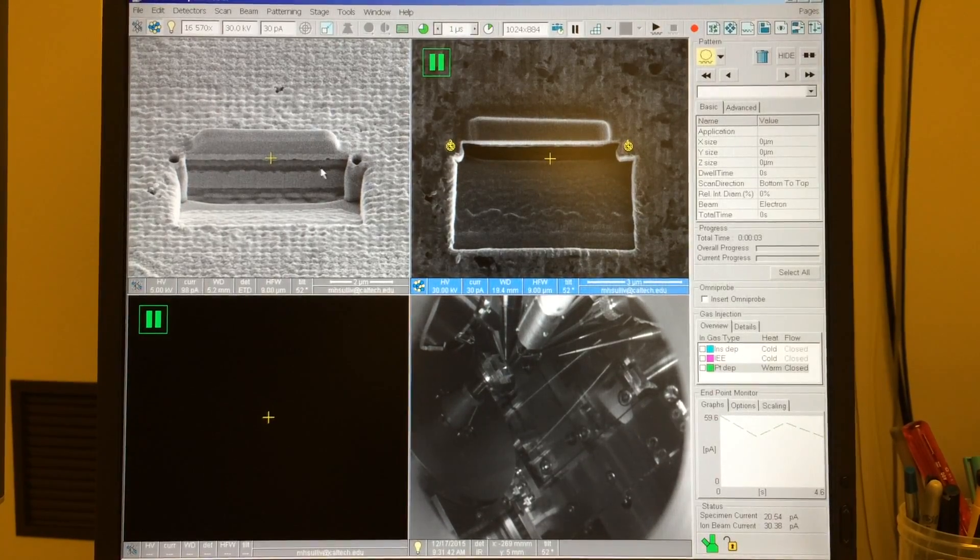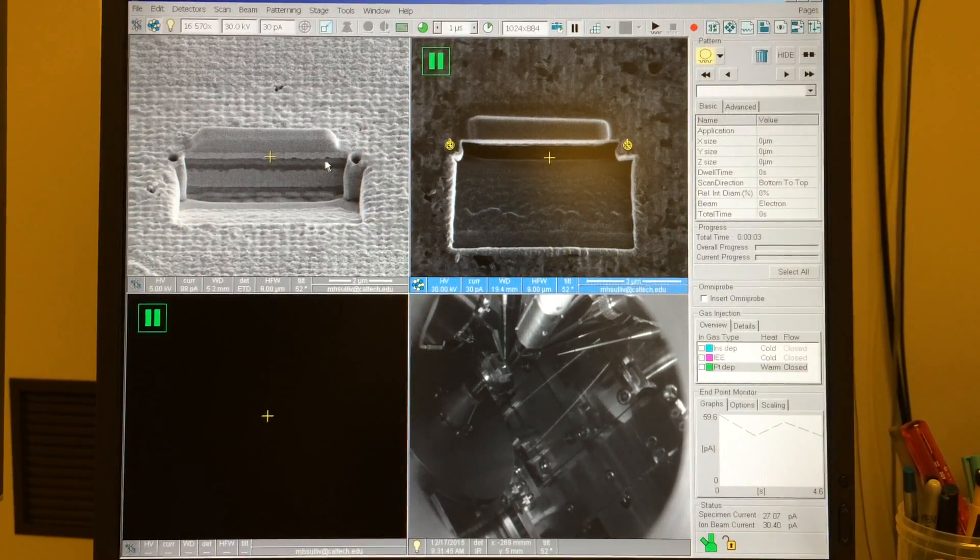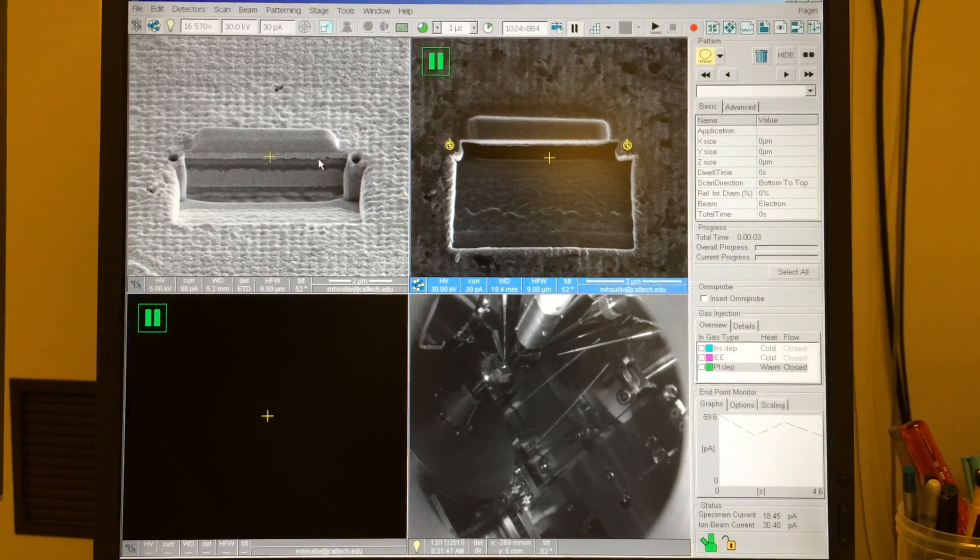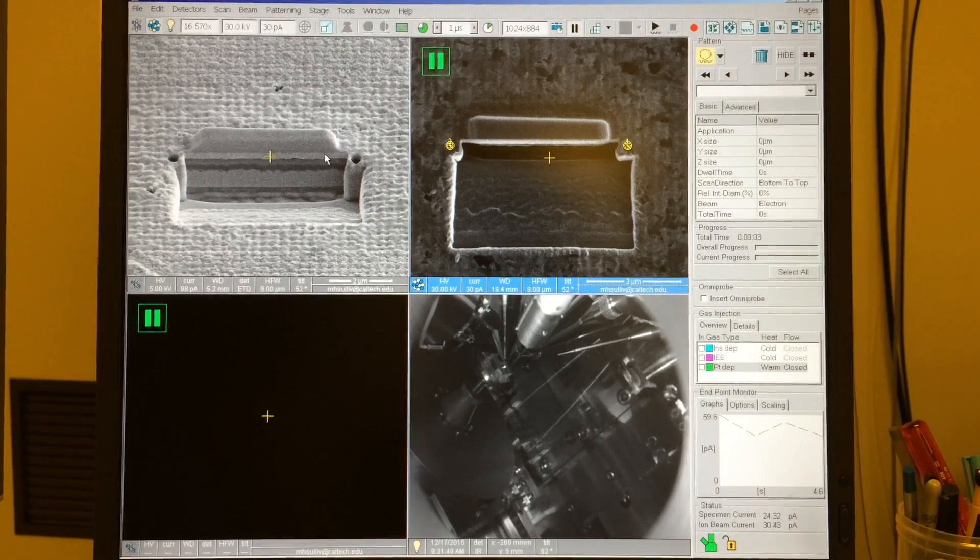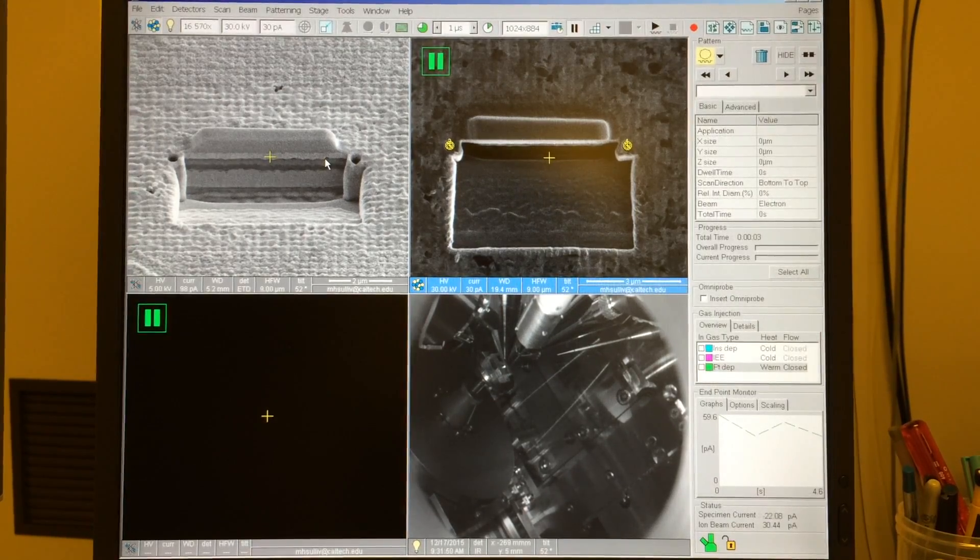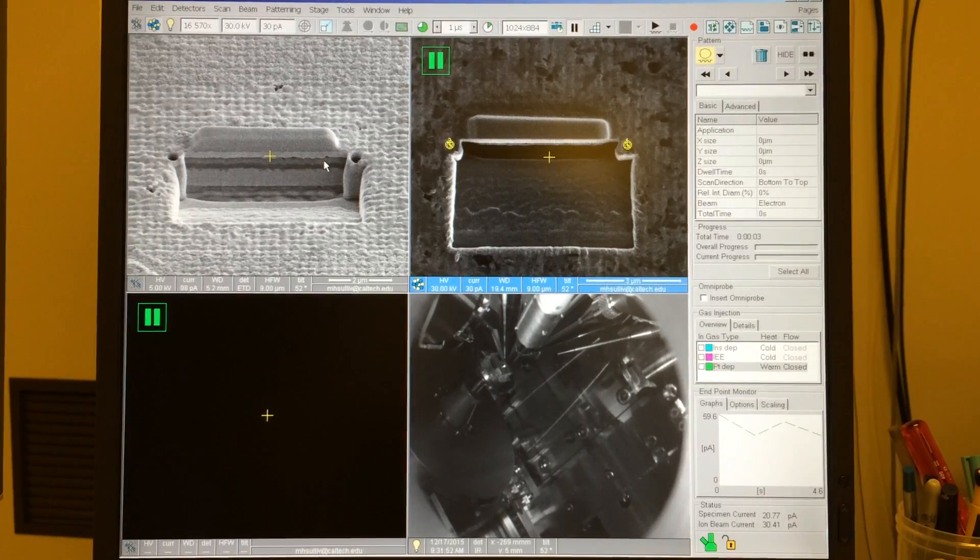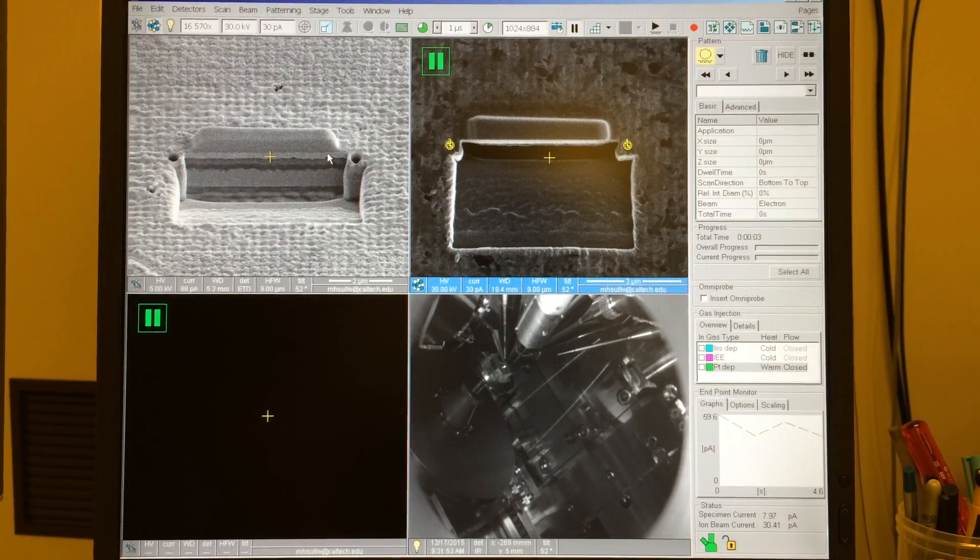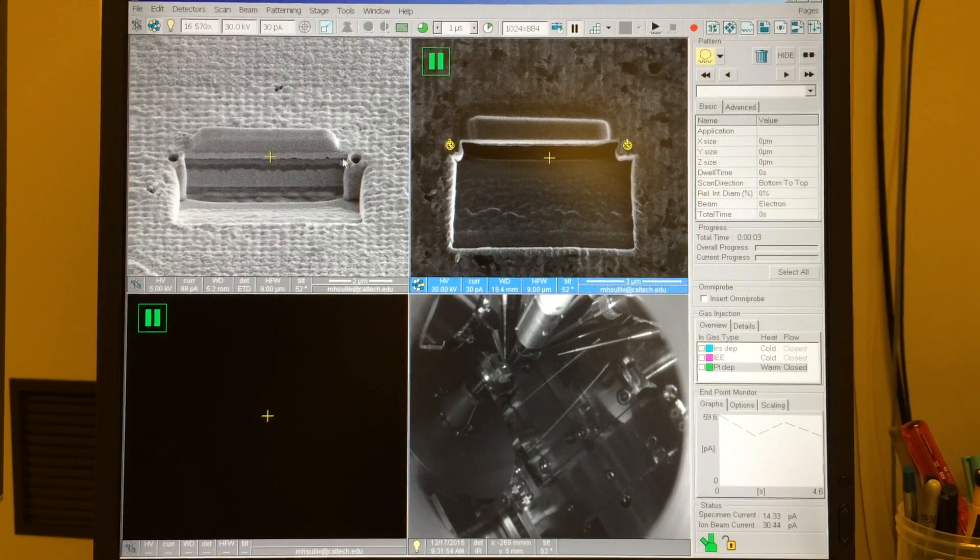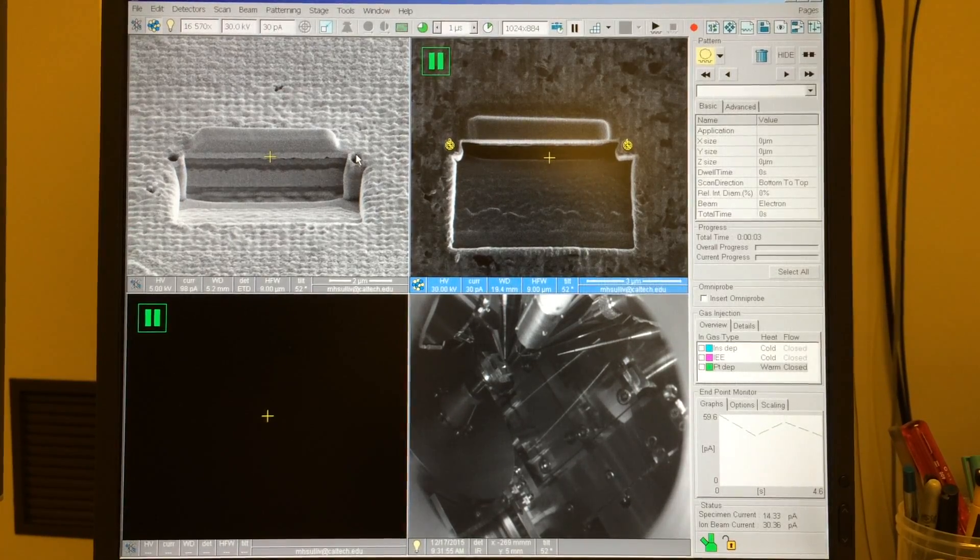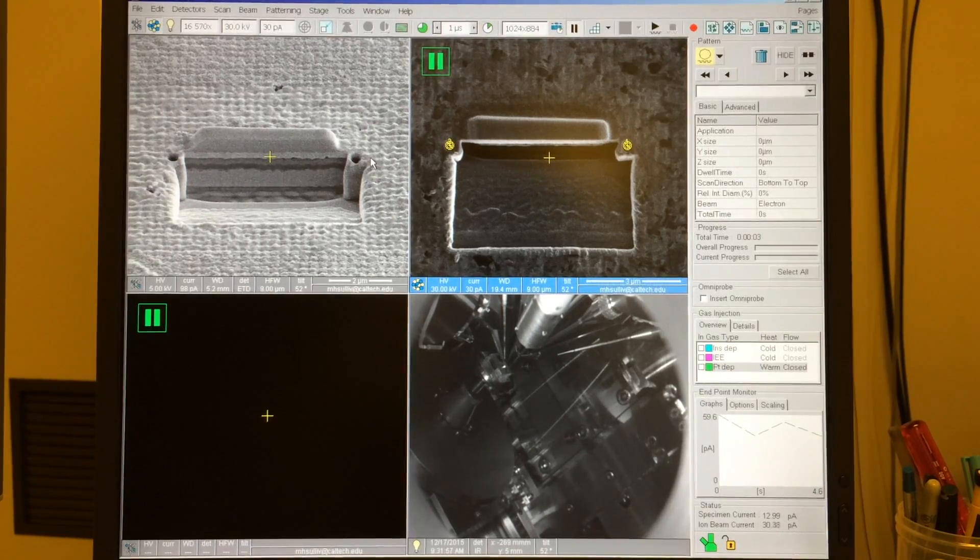And even if you have some distinguishing features on the specimen surface, sometimes you don't want to spend too long focusing and perfecting astigmatism there because you don't want to put a lot of beam damage onto the specimen itself. So, these circles will help us with that first approximation alignment.